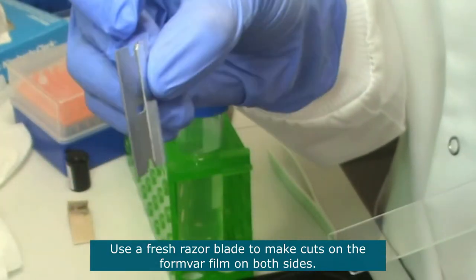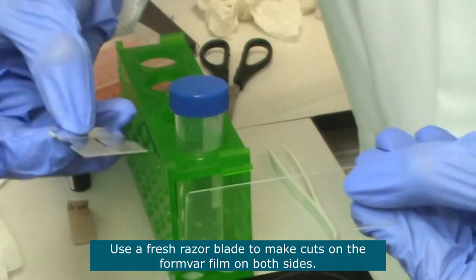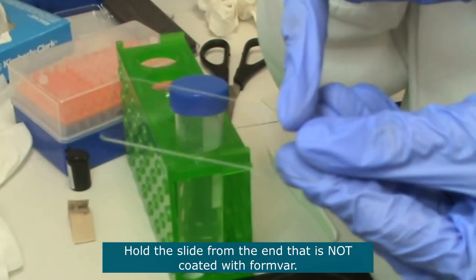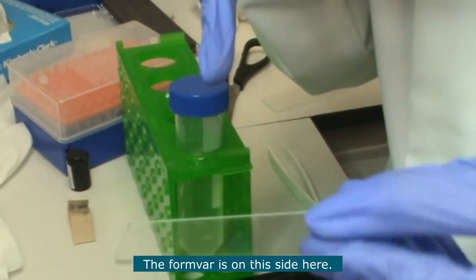Now use a razor blade to make some cuts on the formvar to make it easier for the formvar to come off the slide. So I'm holding this slide from the end that hasn't got formvar. The formvar is on this side here, on both sides.